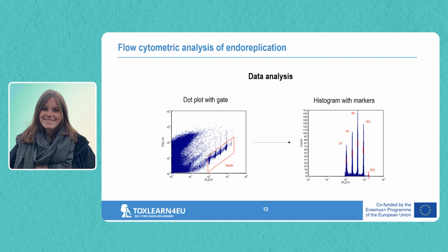You will see that here you really have very many dots very close together, but these are actually not the nuclei. These are not particles that we're interested in. This is just some debris. What you also need to take into account in plant cells, you have many autofluorescent compounds, such as chlorophyll, for example, and these can also interfere with your measurements. So everything that we see over here, we're actually not interested in.